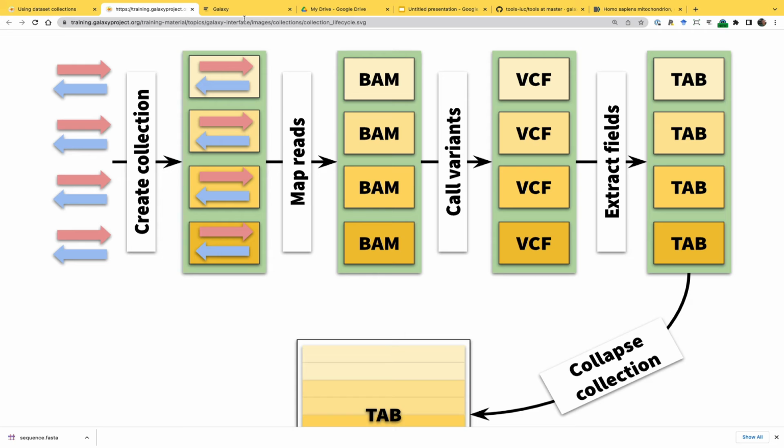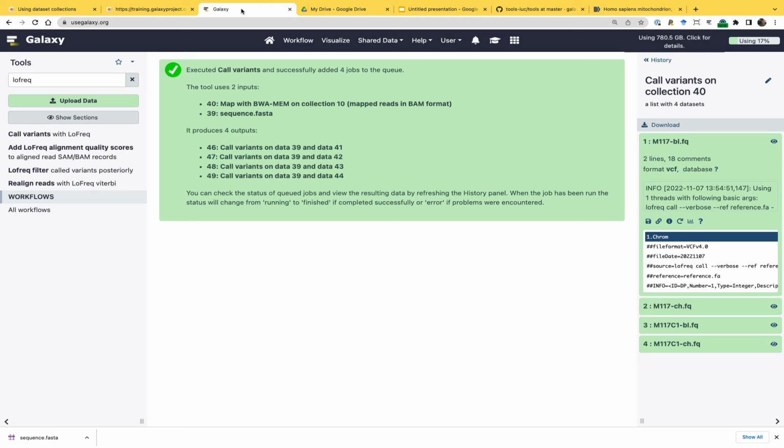By the way, I failed to introduce Greg Van Kooster, and he's been with the team for quite some time, and right now he's running the Penn State instance of Galaxy. So we are using usegalaxy.org, which is a big public site, but there's actually a Penn State instance dedicated to Penn State, and it has much better waiting times than the public service. It just doesn't have a training key. But he'll tell you more about that.